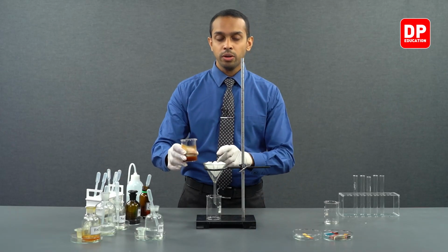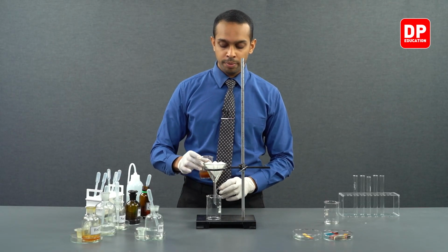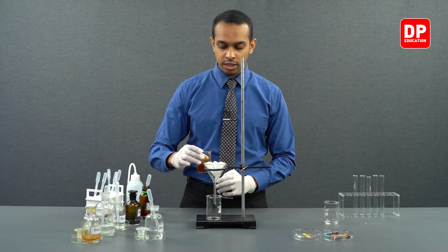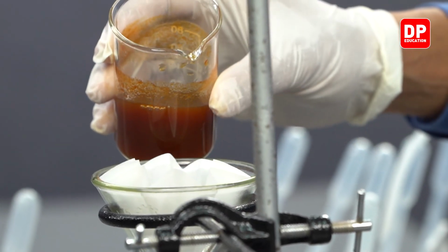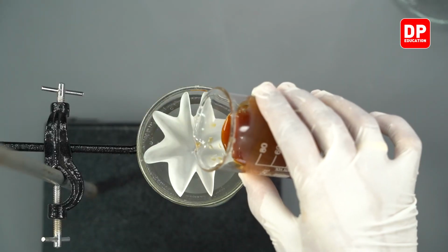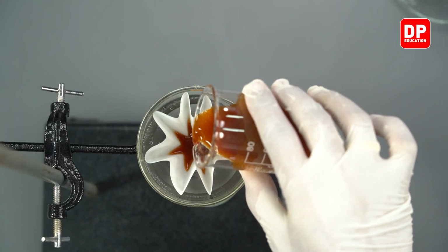So, after wetting our filter paper, we will start transferring our suspension onto our filter paper. We will make sure the suspension is mixed really well, and then we will transfer it onto our filter paper.